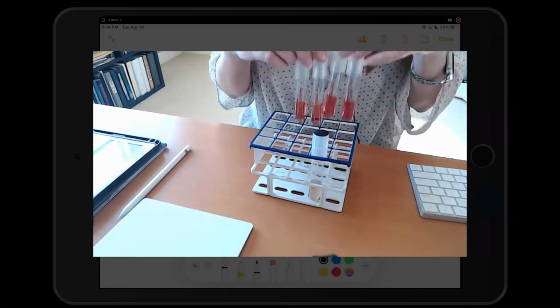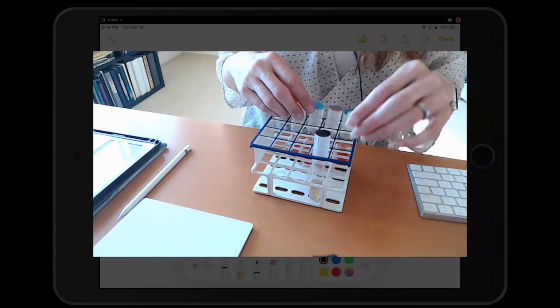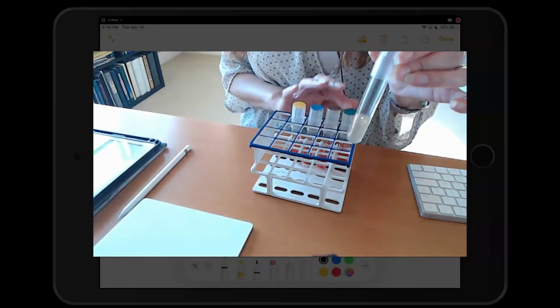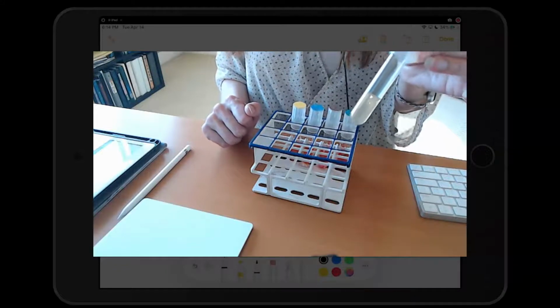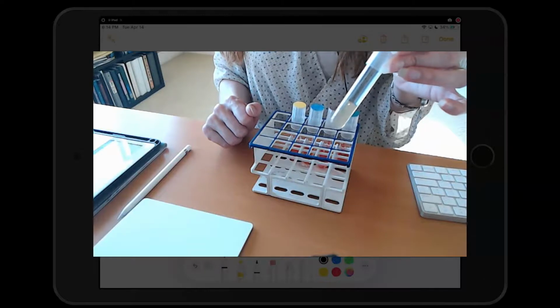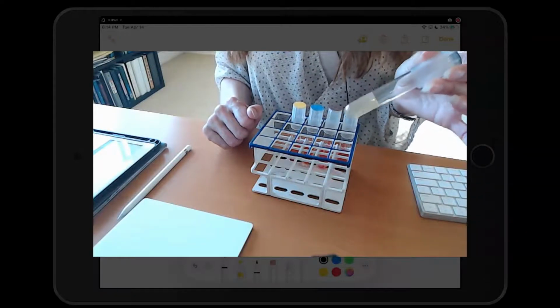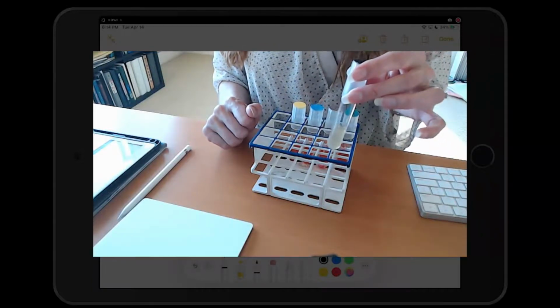But unlike the carbohydrates that require an 18 to 24-hour incubation period, the gelatin requires almost about a week and a half. It takes a while. Okay? So we're going to incubate it at 37 degrees or 25 degrees, whatever the optimum growth temperature of the unknown is, for about a week and a half. Okay? So that's the first experiment for exoenzymes.